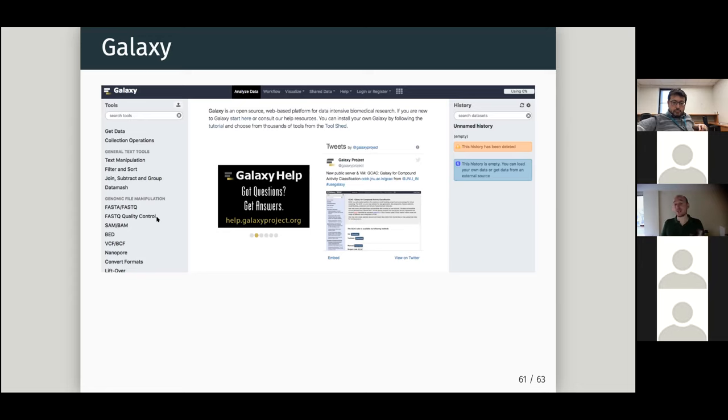on Thursday. The reason why it would be nice if you try it yourself is that, as we said, genome assembly takes time. So if you're able to run it, it should be very simple, very straightforward. There is an E. coli data set, there is a yeast data set, and there is a fly data set, and you can try all of them or just one of them.